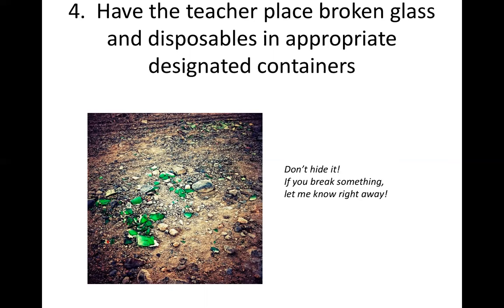So usually for younger students, the one responsible for the cleanup should be the teacher. But for older students, for example, grade 11 or grade 12 students, the cleanup can be done by the students, but it should be supervised by the teacher, okay? Or it should be done in collaboration with the teacher. Okay, so do not place all kinds of trash, broken glasses or paper trash, and used chemicals all in just one container. You have to place them in designated containers.